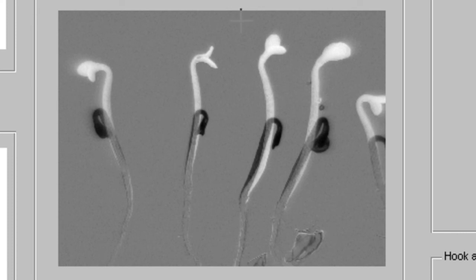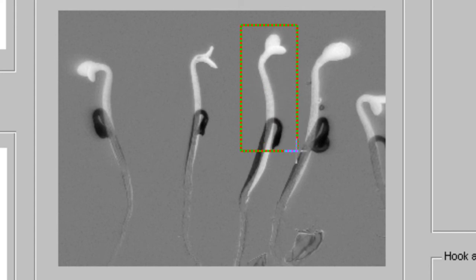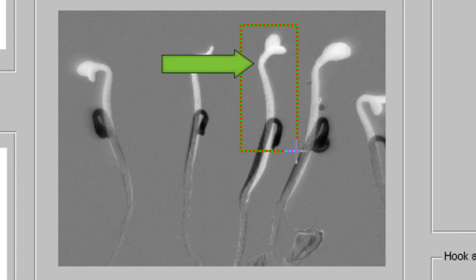When measuring growth rate, it is unnecessary to include the entire length of the hypocotyl in your selection box, as this will increase processing time. Instead, make a selection including both the original image, shown in black, as well as the final image, shown in white.